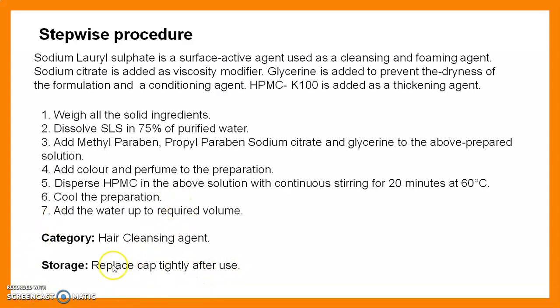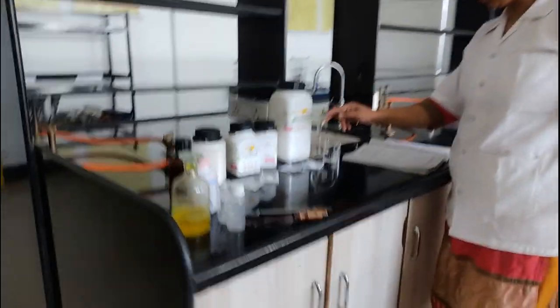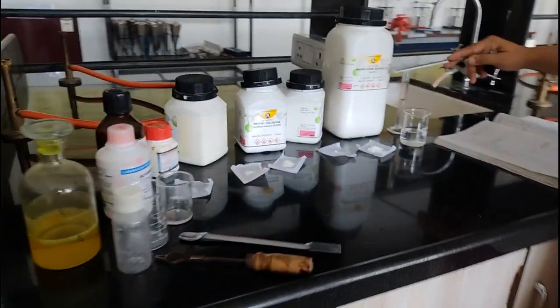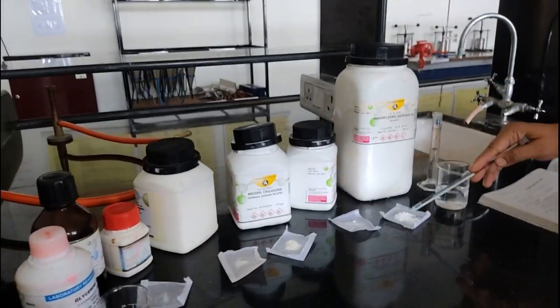Welcome, dear students, to the laboratory session. In this session we see how to prepare the clear shampoo — today we prepare 10 ml. The formula is prescribed for 100 ml but we prepare only 10 ml. The chemicals required are: sodium lauryl sulfate, 1 gram (already measured).